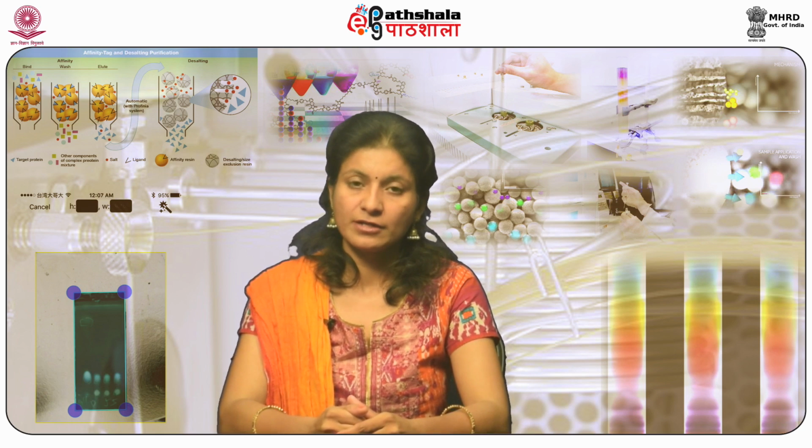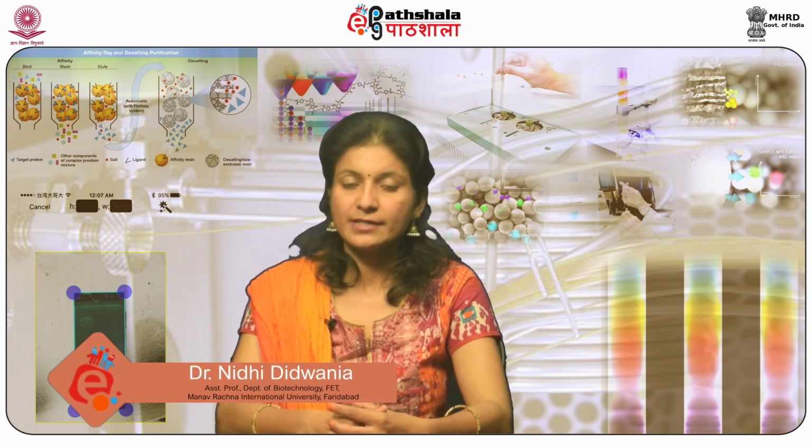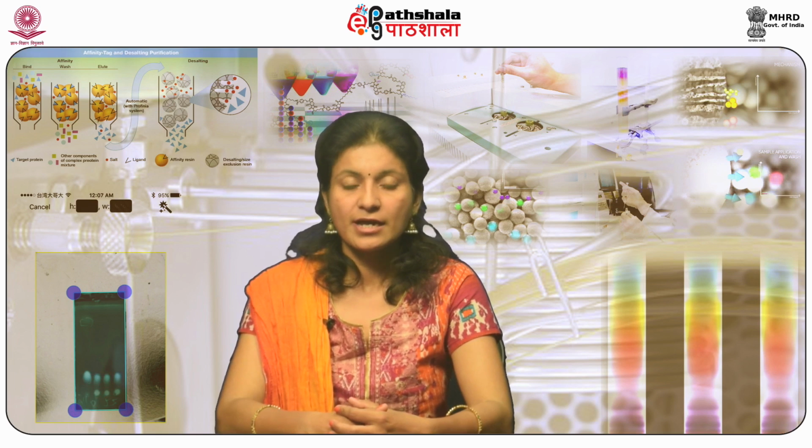There are wide variety of applications of gas chromatography in different fields like pharmaceuticals, food, flavor, fragrances, environmental analysis, forensic sciences, etc. Gas chromatography has thus numerous advantages and a few disadvantages as well. Thank you.